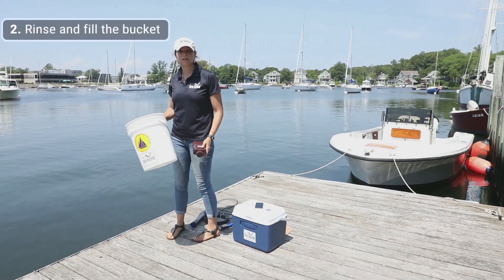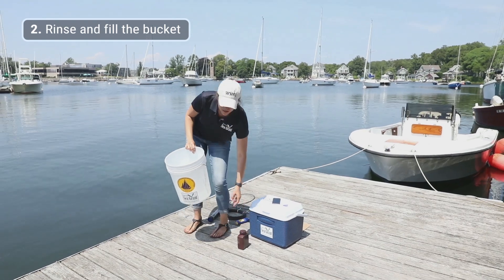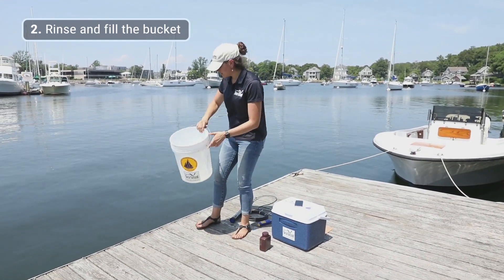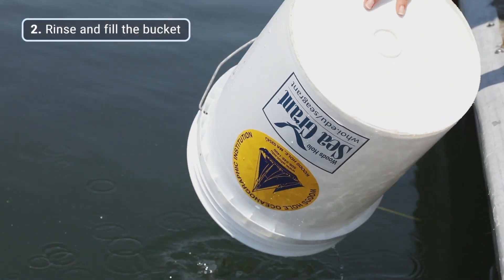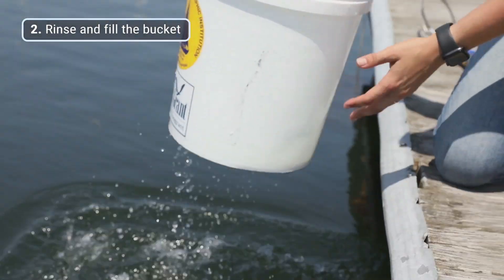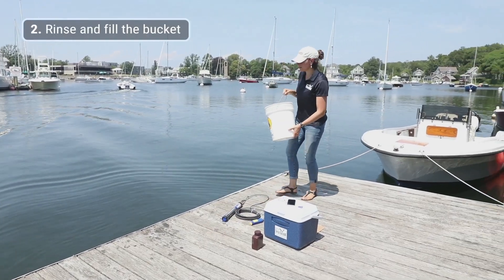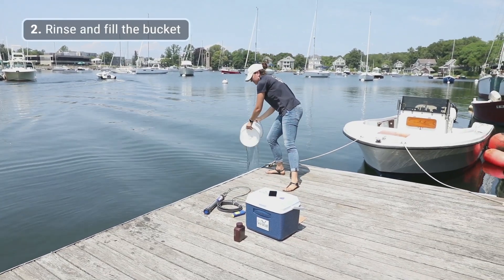The first thing we're going to do is rinse our bucket. We want to make sure we avoid cross-contamination between samples. So we're going to take our bucket and fill it roughly a quarter of the way, mix our water around and swirl to rinse the bucket, then dump that water downstream of where we're collecting our sample.